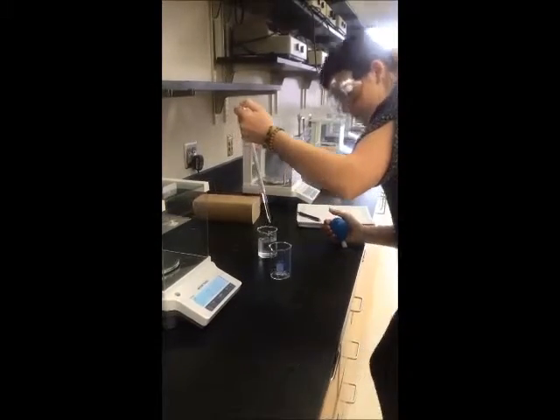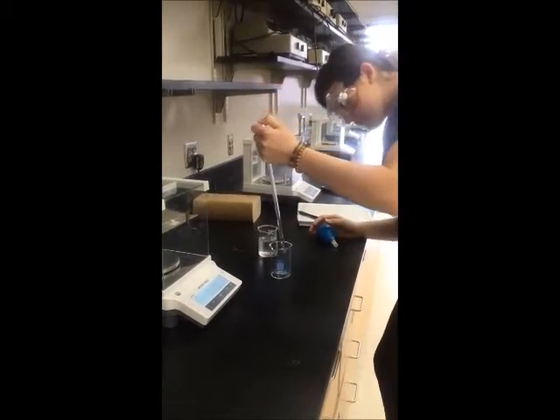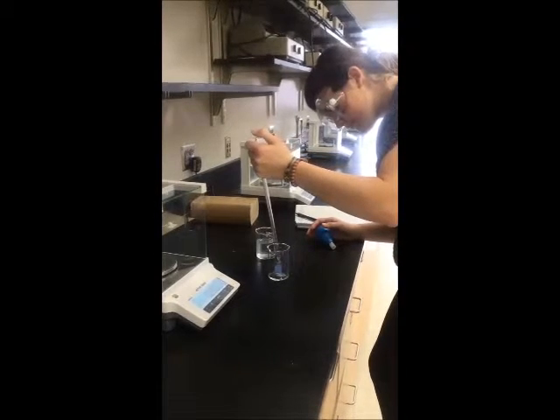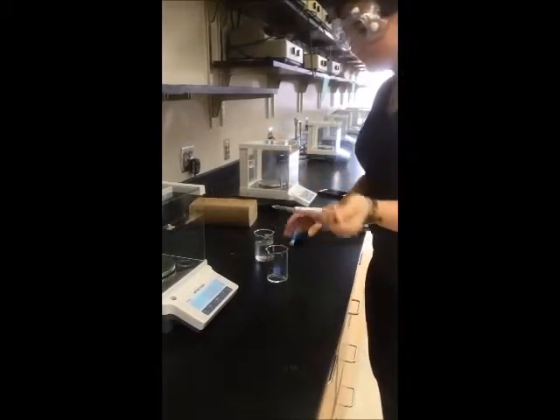You then want the mass of the solution. Put the beaker with the solution inside and record every decimal place that shows in the balance. The difference of the two masses is the mass of the substance. Simply subtract them.